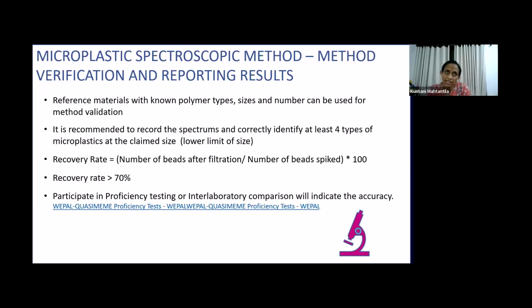So for the method validation, we use repeatability, where the same person analyzes samples at the same time, and reproducibility, analysis by different persons and at different times, and the sensitivity, the LODs, we have to calculate them. We do the recoveries also. For the verification, it means that it's a standard method. We have to practice as per the standard and see whether we can achieve those LODs.